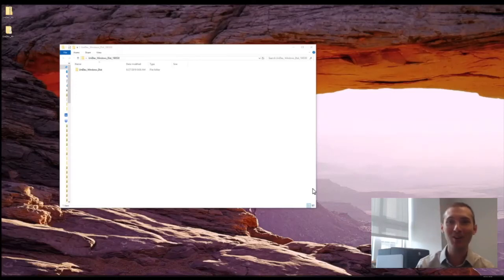Hi, I'm Michael Marty, and I'm an assistant professor from the University of Arizona. I'm not in Arizona today. I'm in Columbus, Ohio at the National Resource for Native MS Guided Structural Biology. And I'm going to give you a tutorial today on our software called UniDec.